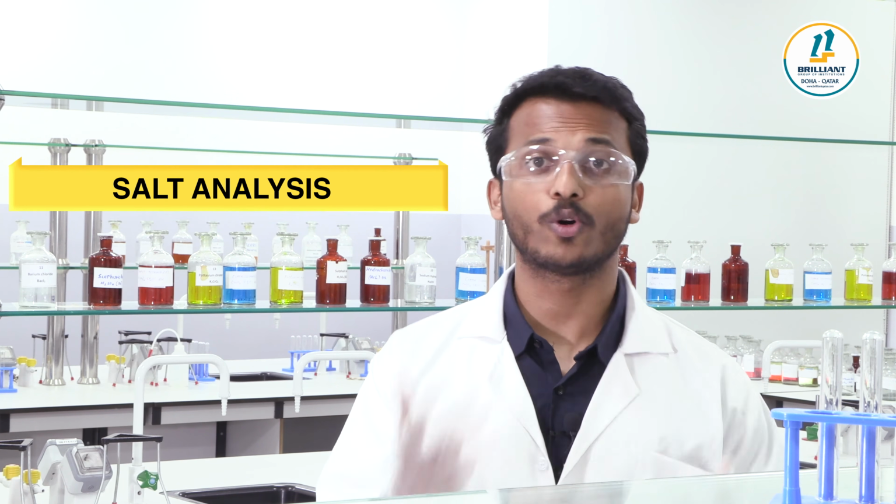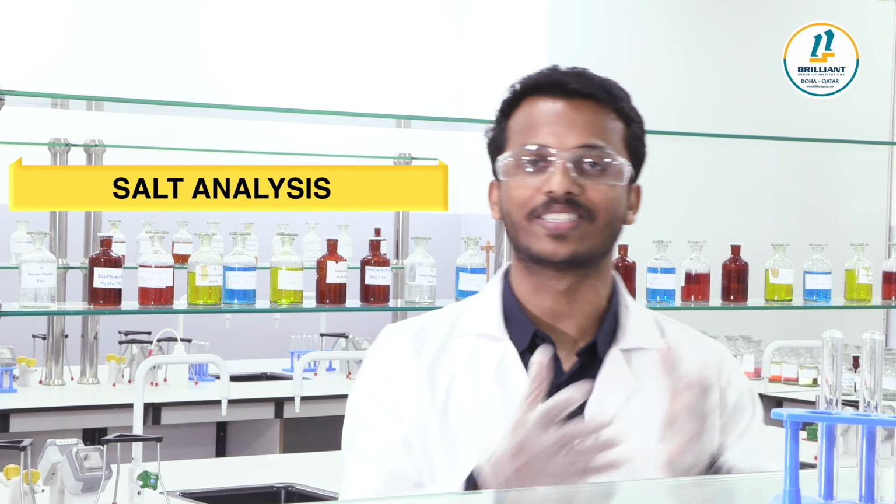Here we are going to discuss how to do the salt analysis in a chemistry lab. Dear all, a given salt contains a cation and an anion. So we have to report to the teacher that the given salt contains this as the cation and this as the anion. Here I am going to discuss certain cations and anions, how to do the preliminary test and confirmatory test, what the observation is, and we can discuss it in detail.